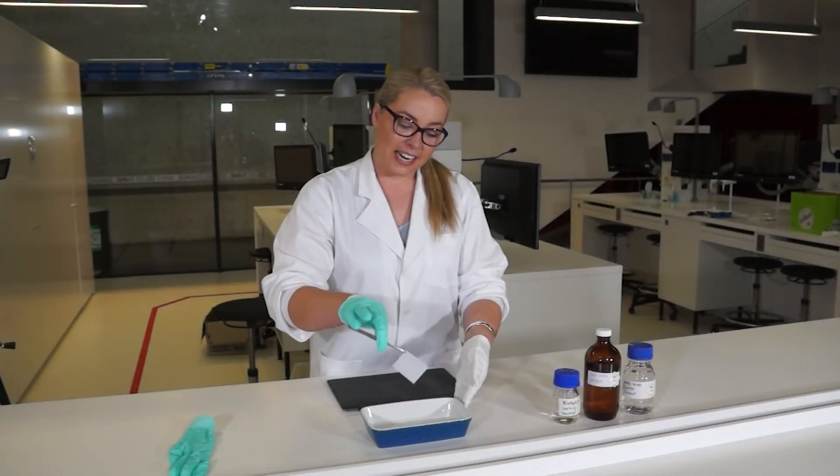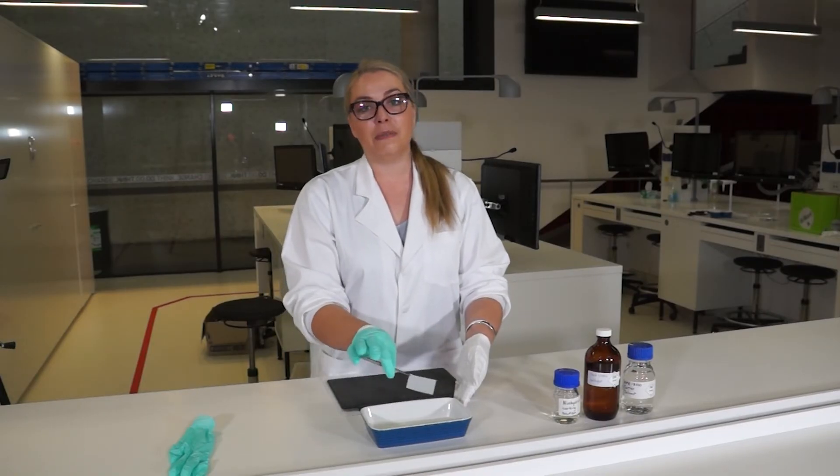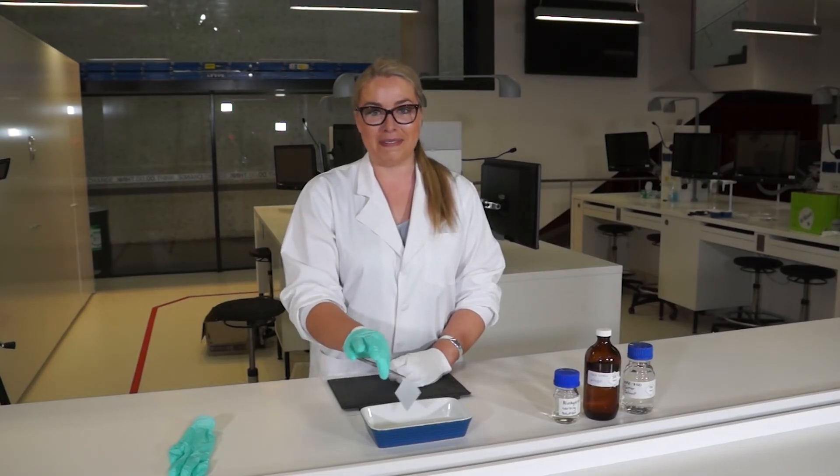Then we take it out and we just allow it to drip dry, and then we can hold it for a second. If we wave it, all of the solvents that have just soaked into the paper will come off and we will be ready to continue development.